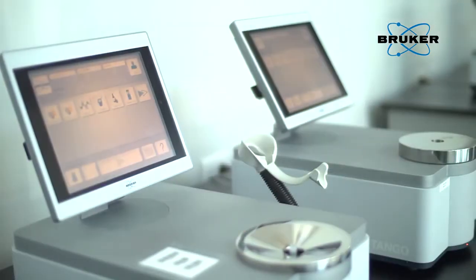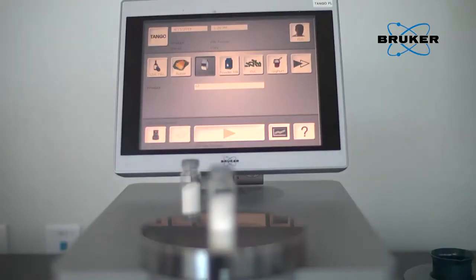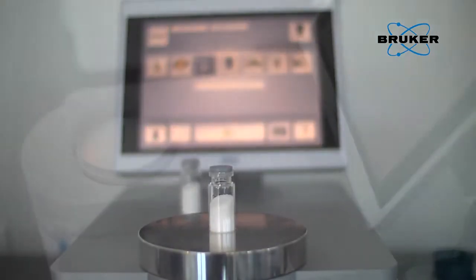Tango-T is a high-performance, rugged FT-NIR spectrometer which enables fast and accurate analysis for measuring several quality parameters in your liquid chemicals. The Tango-T comes standard with an active heating and cooling system, which monitors the vial inside the sample compartment, ensuring that your measurement is at the correct temperature. Temperature settings run from 20 degrees Celsius all the way up to 80 degrees.